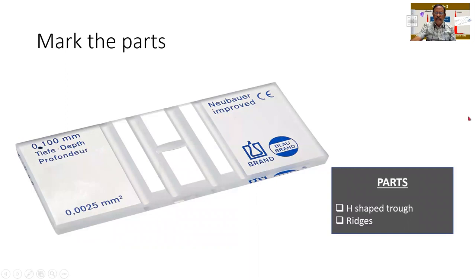I would like you people to kindly follow this for any of the instruments. As I told you earlier, what is the instrument? The answer is given over here. It is an improved Neubauer chamber, which students don't answer. They don't look at the instrument at all. It is given over here. It has got a depth of about 0.1 millimeters.